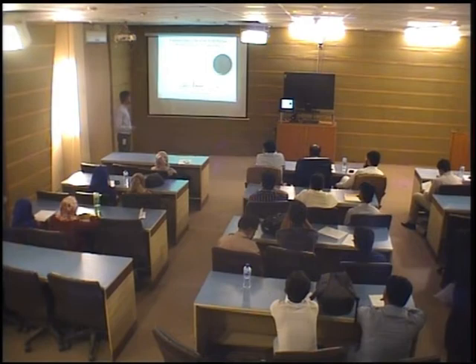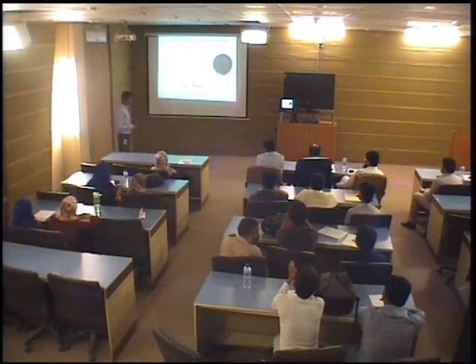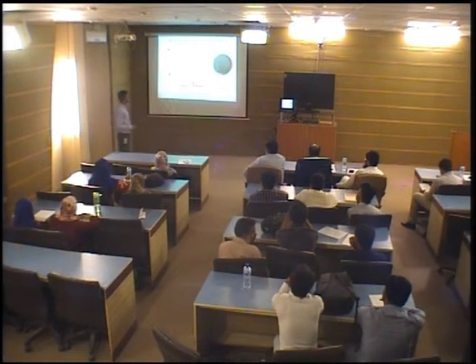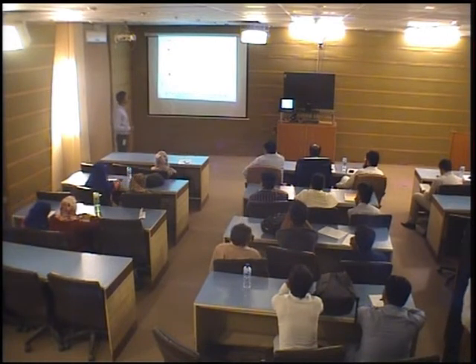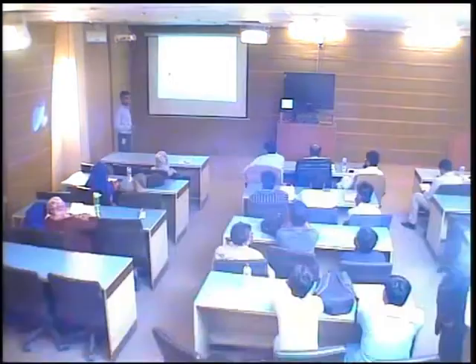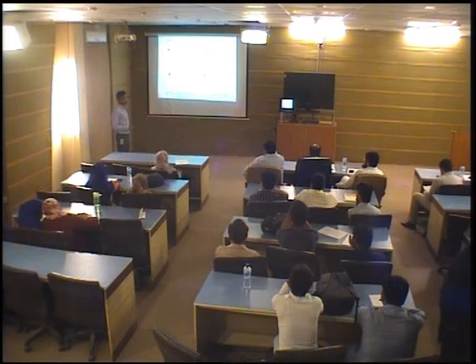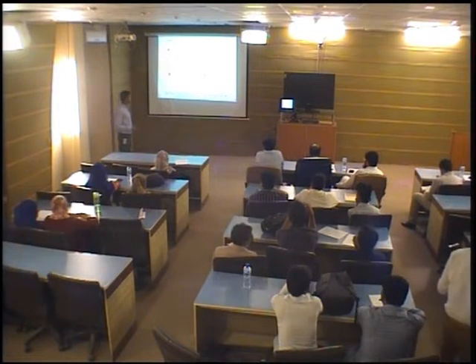To analyze the emission spectrum, these peaks are emission lines. We divided this whole spectrum into small portions. In figure A, it ranges from 216 to 249. We have found almost all lead emission lines except one carbon, which is observed at 247.85 nanometer. In figure B, it ranges from 256 to 292. It is a bunch of lead lines.